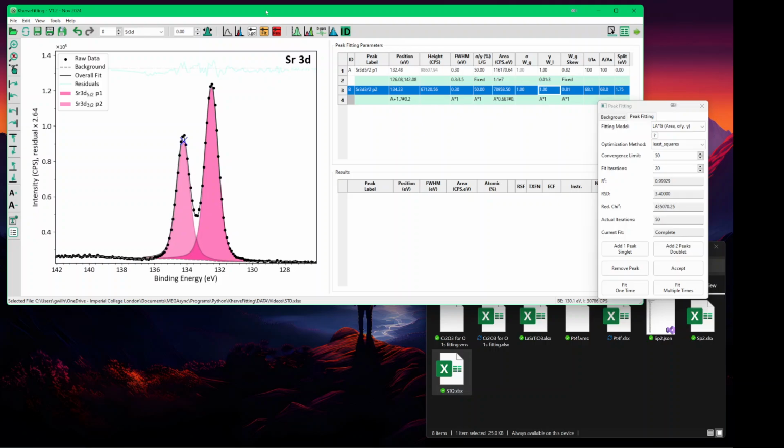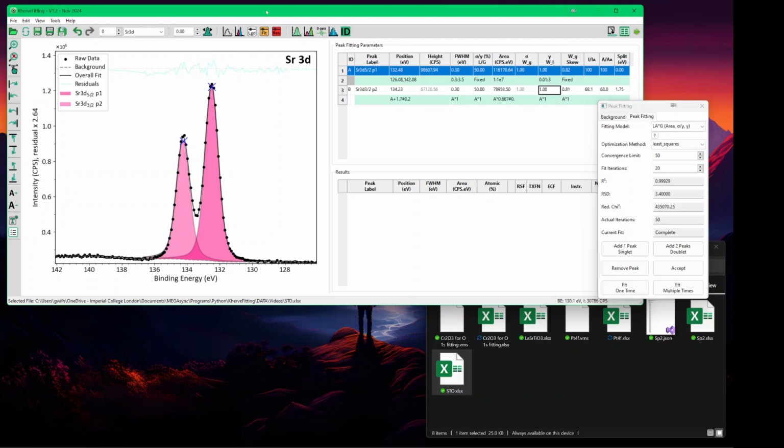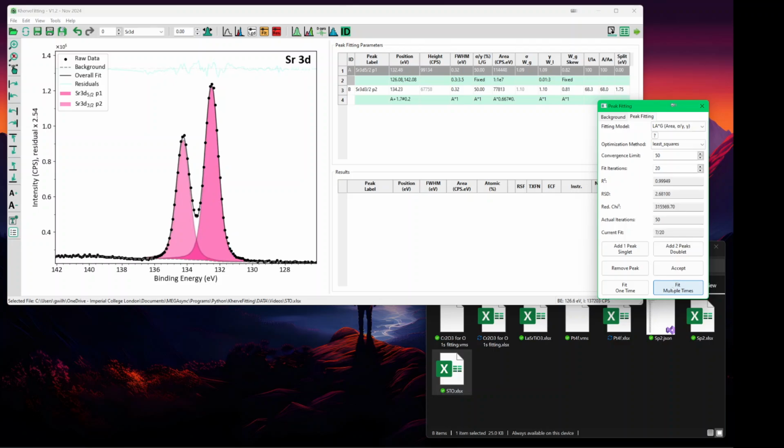So for example, if I go now to tab A, and I'm now constrained into pick A, I could move it, but I can also move it by keyboard. So now I will go down and move it somewhere here, and let's see if this will go to 1. So it's finding that it's very close to 1.